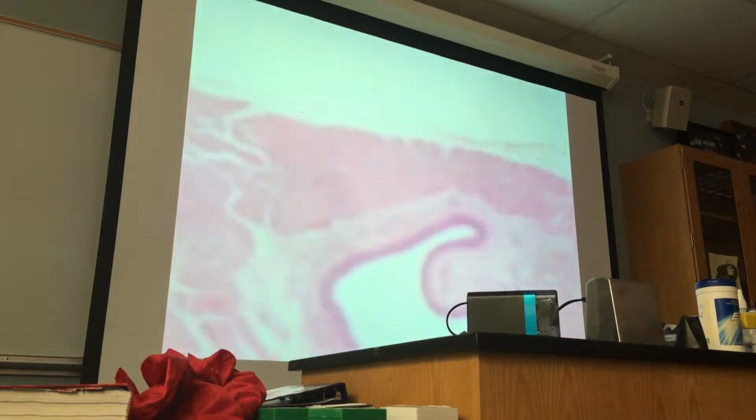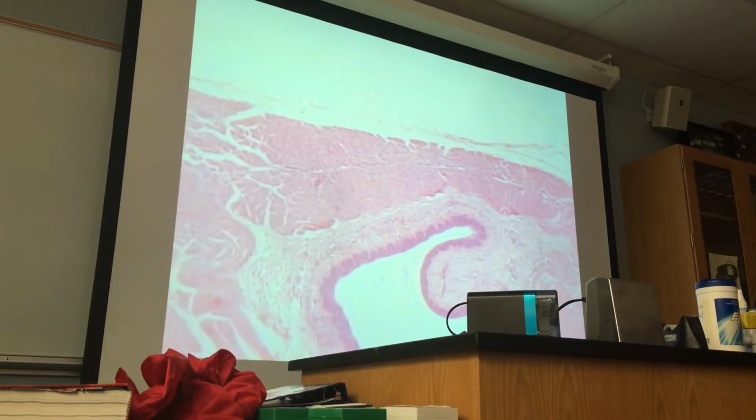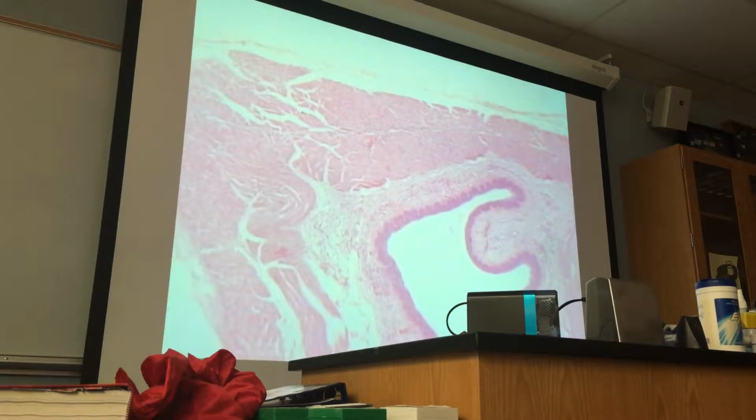But if I want you to identify the adventitia, I have to show you several features. Like here, if I ask you to identify the structure as indicated, this is adventitia. You can see the different components of the histology of the esophagus. Muscularis, this is longitudinal layer, circular layer. This is the submucosa, and this is the part of mucosa.